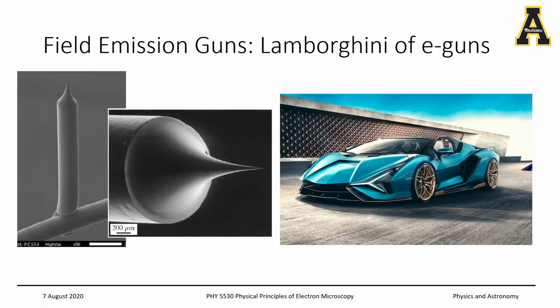Okay, so we'll talk about the field emission guns tomorrow. And as I always refer to them, they are the Lamborghini of e-guns. They're really expensive, but they're really sweet with amazing performance. Okay, that's the end of it.